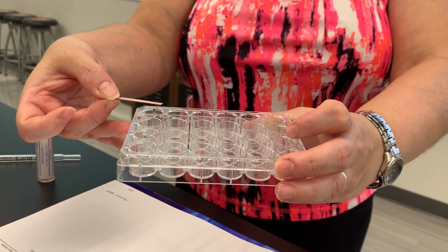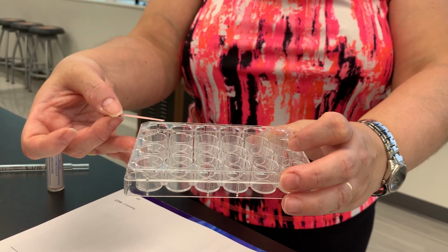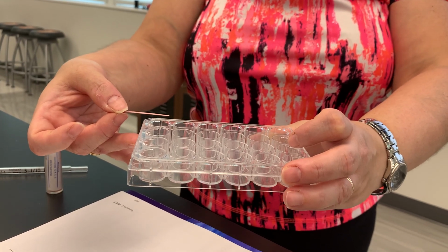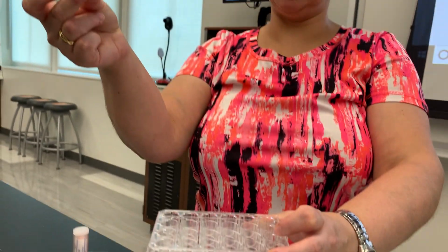So if you think that might be a possibility for any of your unknowns, for example, I suggest you run the same test in the medium-sized test tube. Just make sure the test tube is clean. Add your chemicals, and then place the strip in the test tube without touching the liquid. A test tube is more isolated than these wells, and so it may be more suitable if you need to confirm a positive test for ammonia.